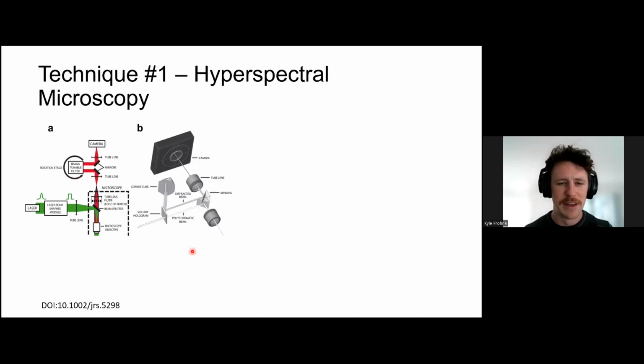So what happens is the light comes in here, is incident on a mirror. It gets hit onto this grating where a small bandwidth of light is dispersed laterally, according to Bragg's law of diffraction. So you'll have a dispersed set of light emerging here. It'll be bounced around this corner cube. It'll hit back onto the Bragg grating again, where it's collimated. But now you basically have light separated in the X plane as a function of wavelength. And then that light is focused onto your camera.